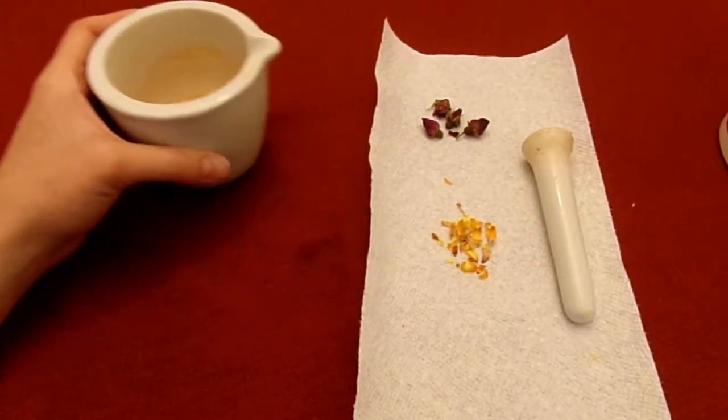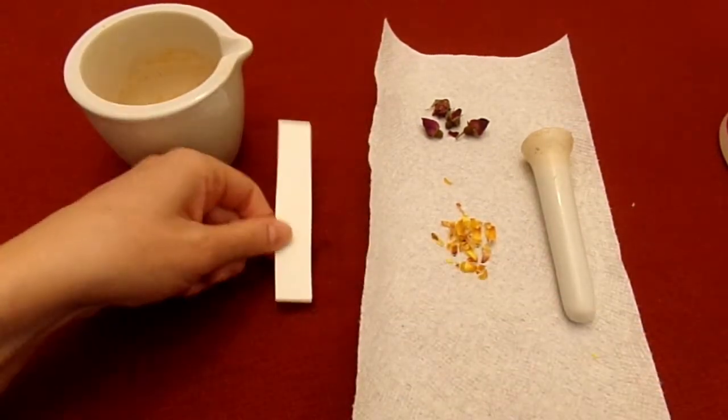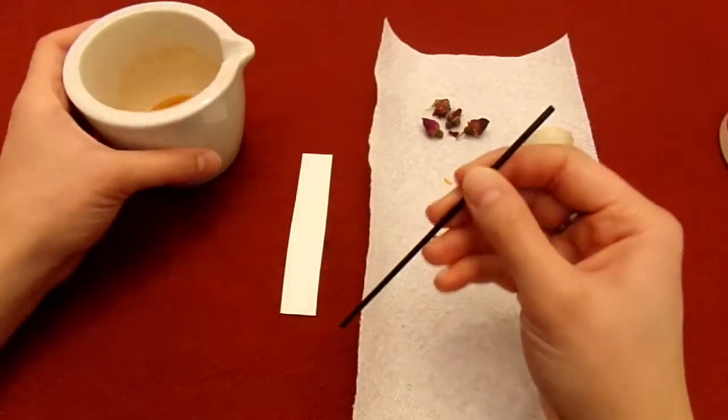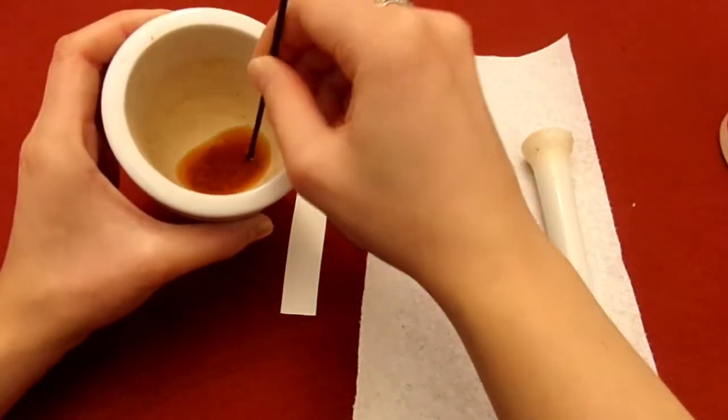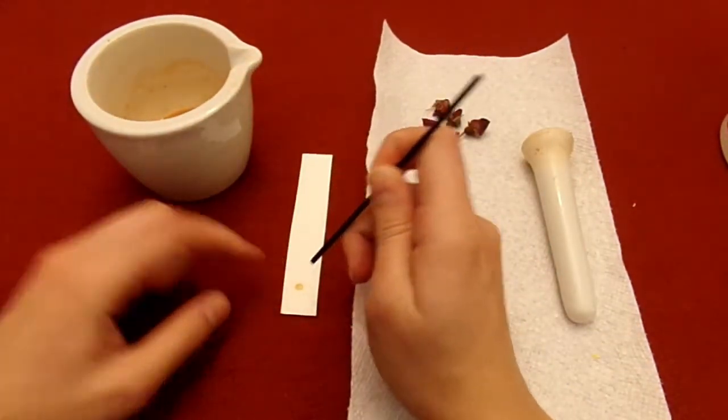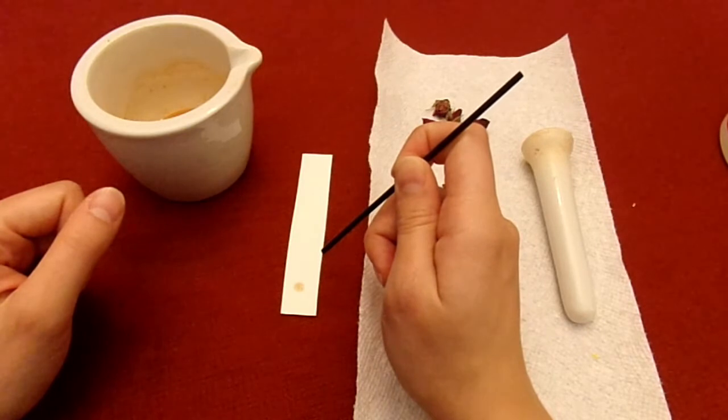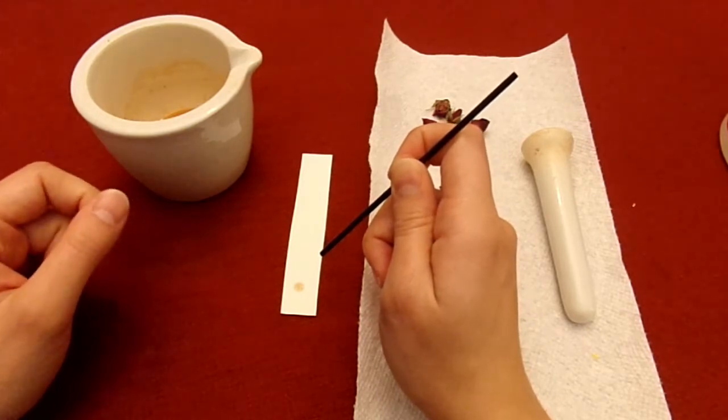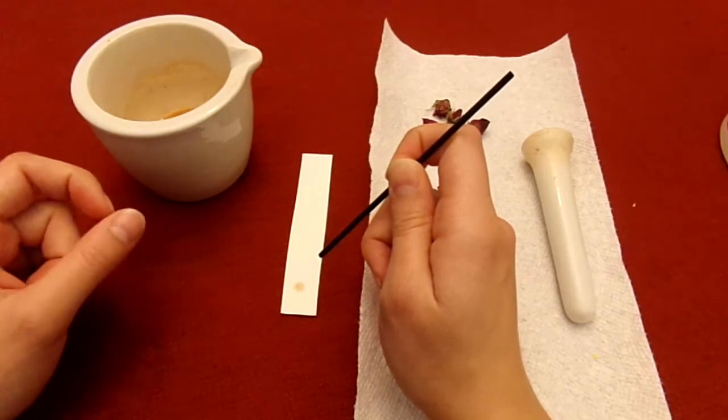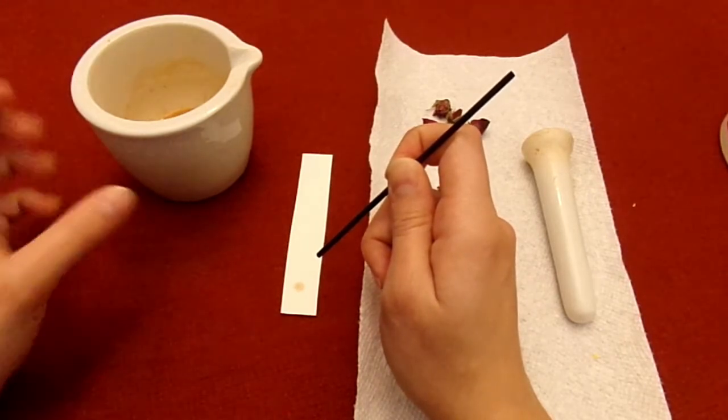Next you're going to take one of your paper strips and one of your spotting straws and pull up some of the liquid and spot it about half an inch from the bottom of the paper. If the color doesn't look very bright, let it dry, and then spot it again. And repeat until you have a nice bright spot.